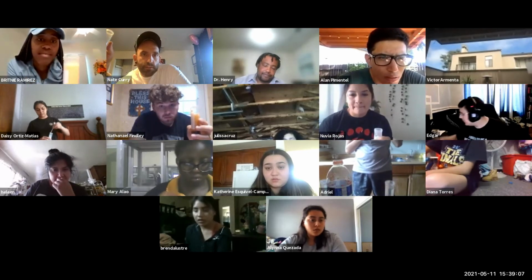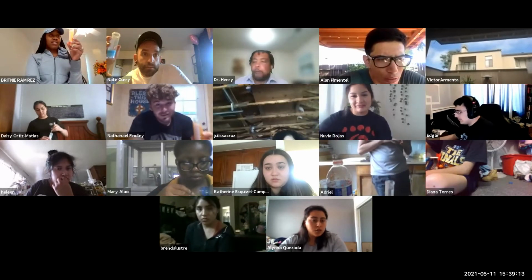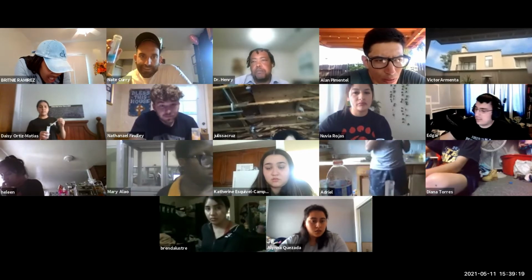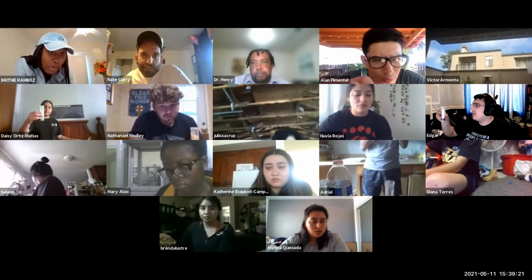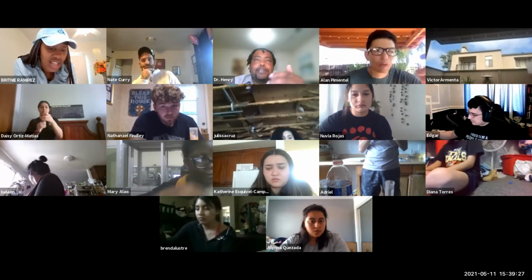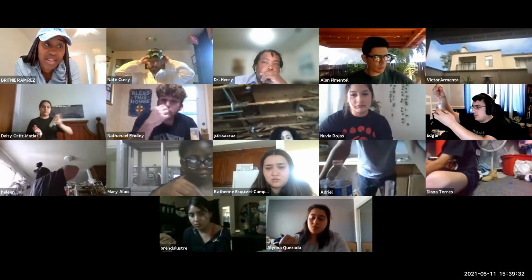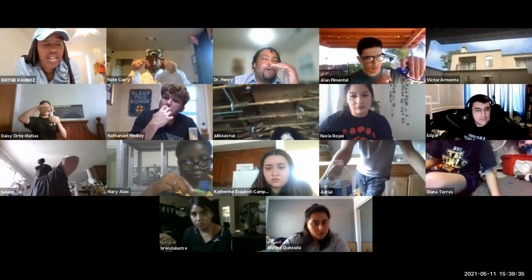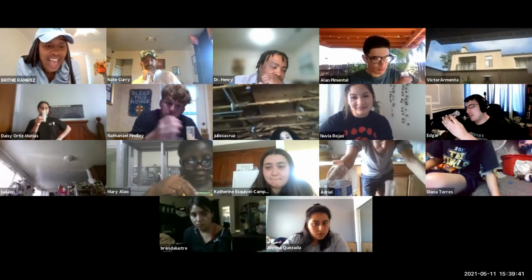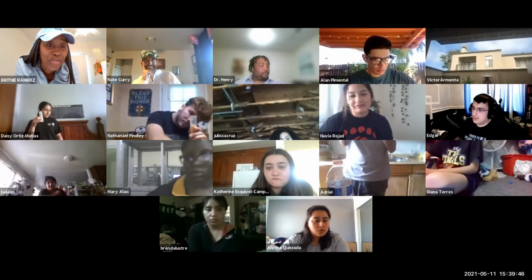There's your answer, Brittany. Are you sure? Set it on a level surface. It's dropping more. Am I supposed to just keep watching as it drops? No, you're not supposed to keep watching it as it drops, because that's what I'm saying. You want to catch it at the peak. So the peak was exactly at the top. But was it over the top or was it at the top? I feel like Dr. Henry doesn't like the answer of it was at the top. My little orange Kool-Aid over here went at the top, Dr. Henry, not over the top.